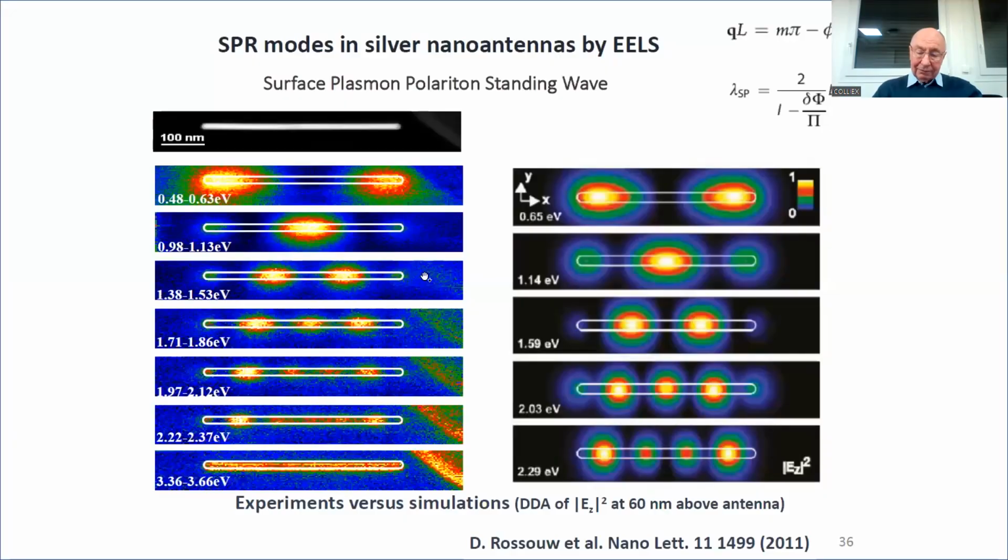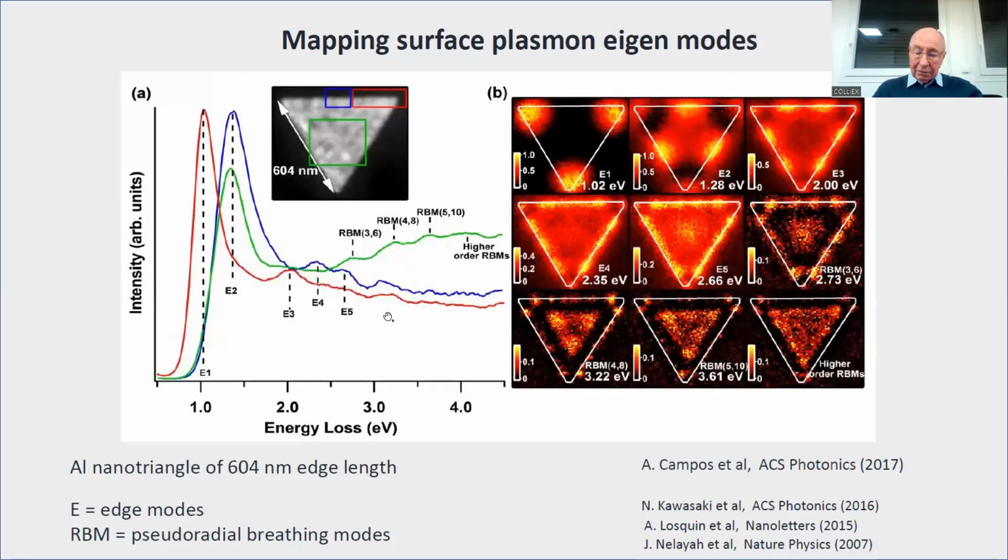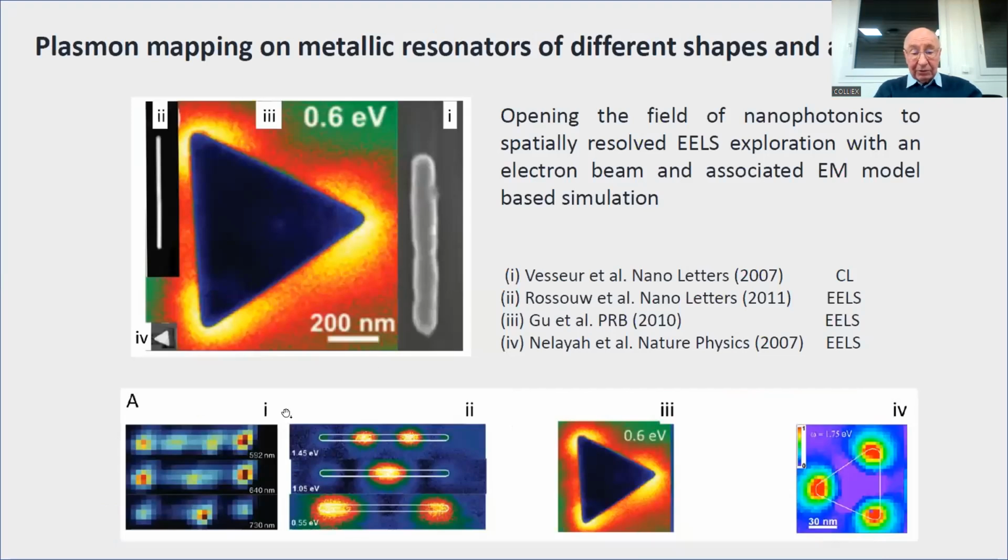And when you look at the response under the beam, there is always localization of the response at extreme position, either at the edge or at the position at the tip, in the middle, or position along a wire.